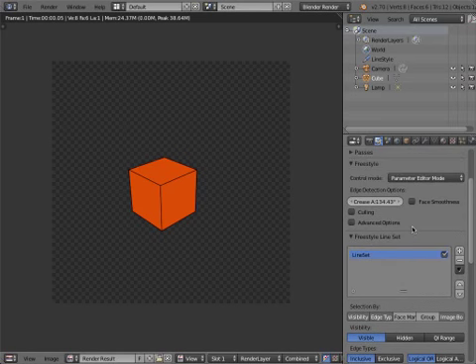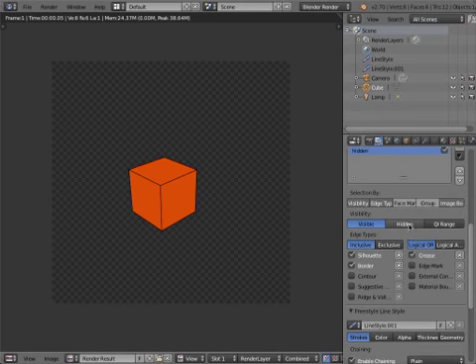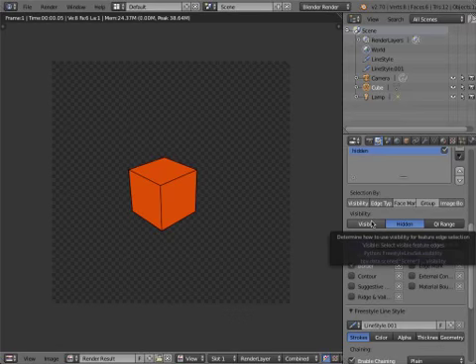So you can have more than one line style set, because sometimes we want to render hidden lines as well. So I'll just show you, if you want to have more than one line set, you just add another line set. Might call it hidden. Go to hidden. So QI range just means occlusion range. Visible means the first layer that the camera sees. Hidden means, I think, everything from the second layer on that the camera sees.